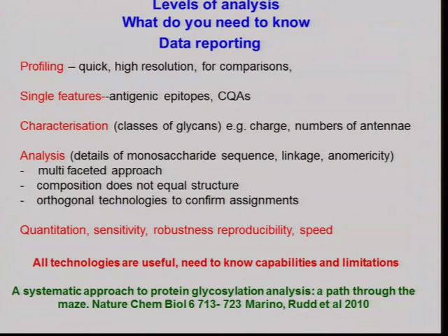If you're doing at-line analysis, you might only want to profile because you know the analysis so well, you just want to see whether various sugars are going up and down as a result of the length of time of the process. And these can be any kinds of technologies. They could be LC, they could be mass spec, they could be CE. There are a whole range of separations technologies that you can choose from.